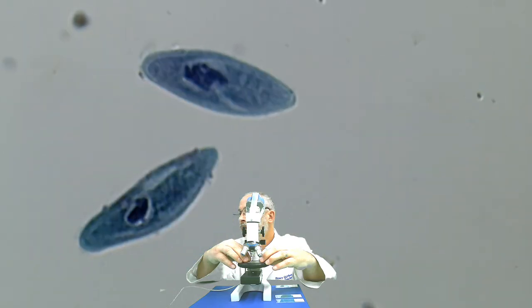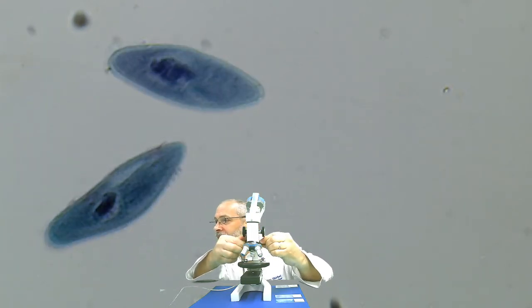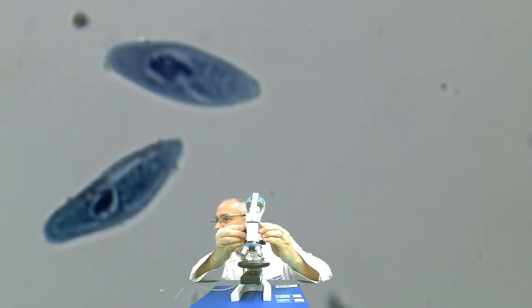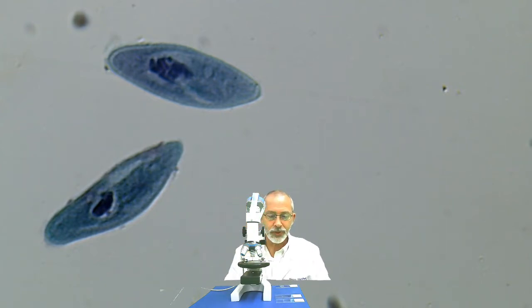I will make this our 40 times magnification here of our Paramecium. So if you need to, you can pause the video at this time to draw these cute little Paramecium under 40 times magnification.